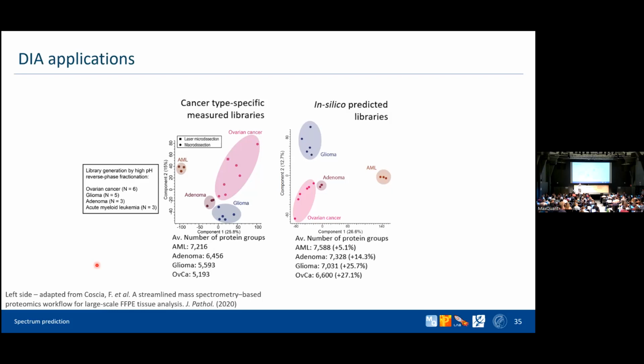If you compared these numbers in percentage, because you always depend on the size of the experimentally derived library, right? Is the size of the experimentally derived library the same as the in silico one, or is the in silico one just bigger and that's why you got higher numbers?